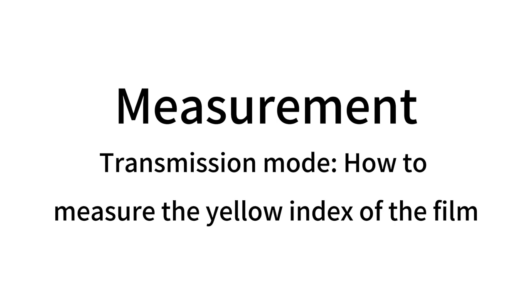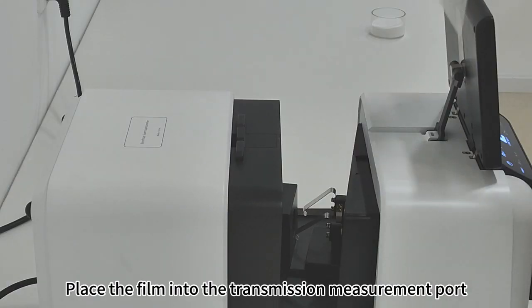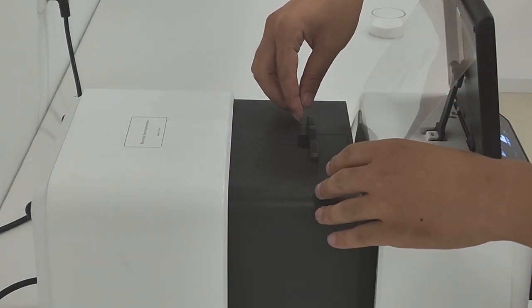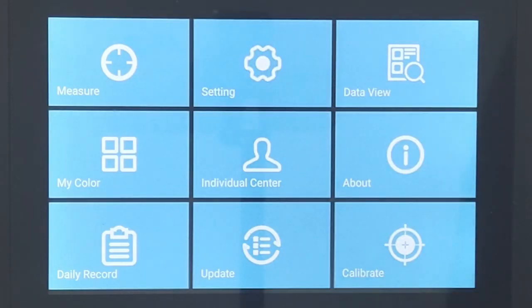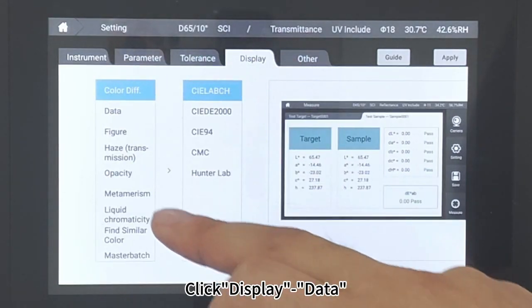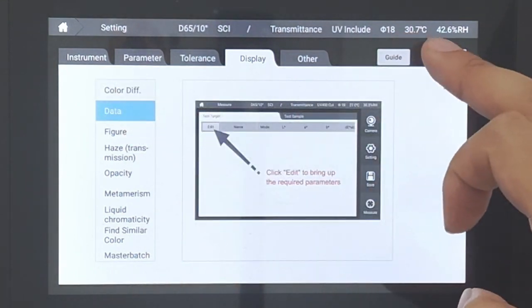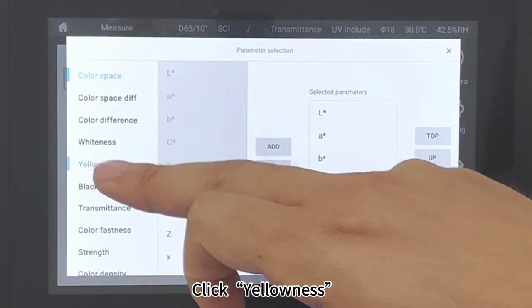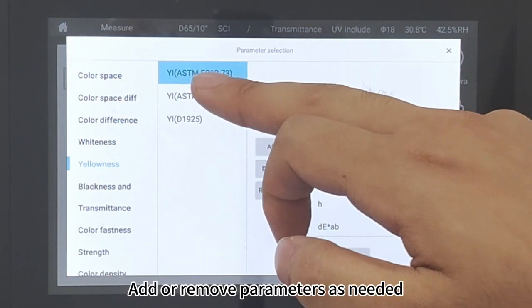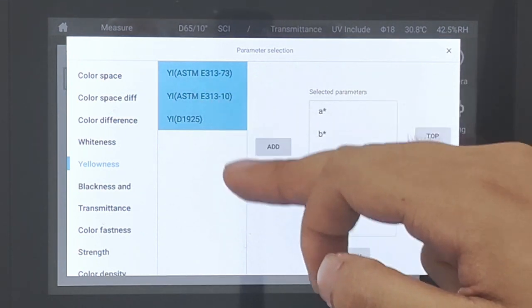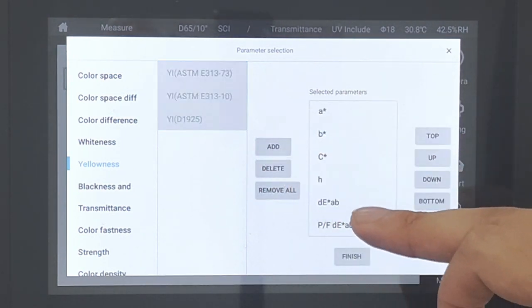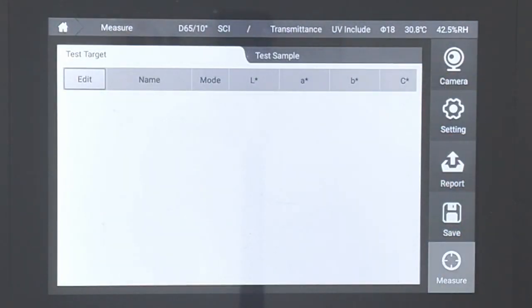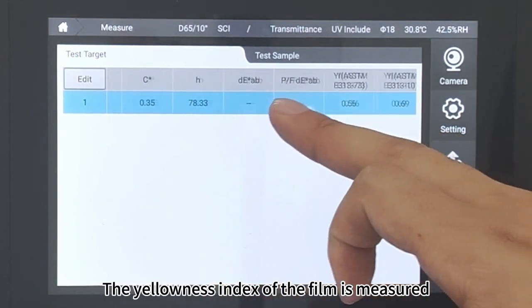Transmission Mode. How to measure the yellow index of film: Place the film into the transmission measurement port. Click Setting, then click Display Data and click Apply. Click Edit — add or remove parameters as needed. Click Finish twice. The yellow index of the film is measured.